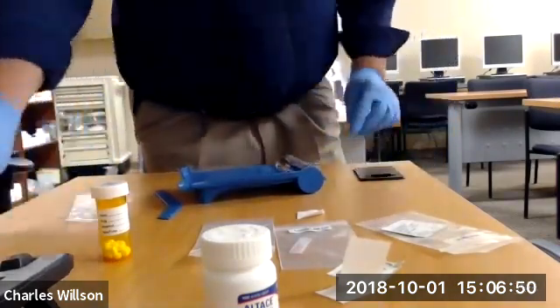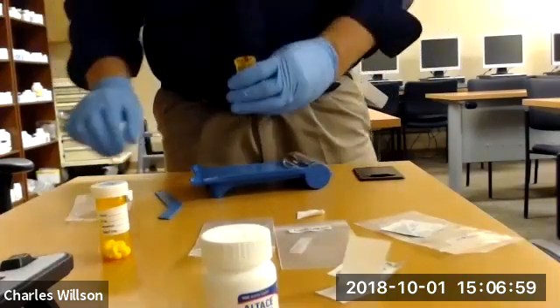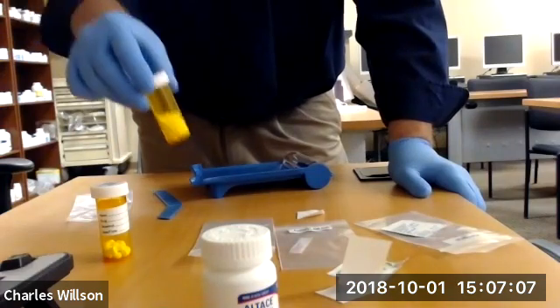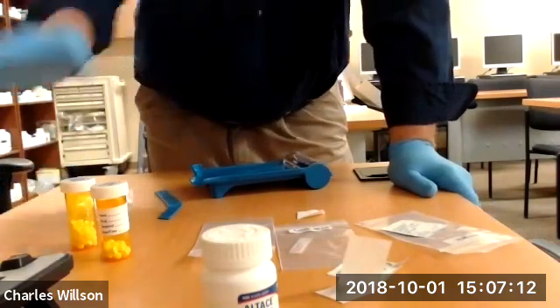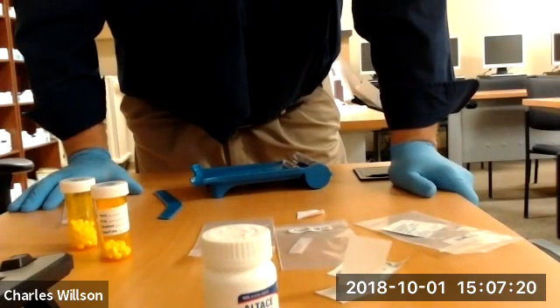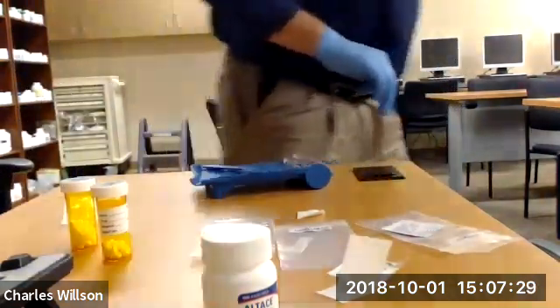So we counted them. And then we're going to put them into a prescription vial. What do they call an orange pill container? It's an amber vial. Okay, but if you want to call it an orange, yeah, for now we can call it an orange tablet container. Okay. And it needs to have a label. And if your kit's like mine, you probably don't have another label for this exercise. So, okay, if you don't have another label for this exercise, I understand because I didn't. And so that won't do anything to your grade. Okay. But ordinarily you'd put a label on there, obviously.